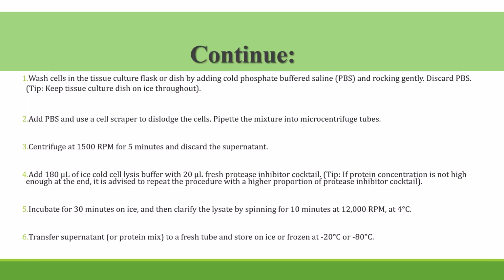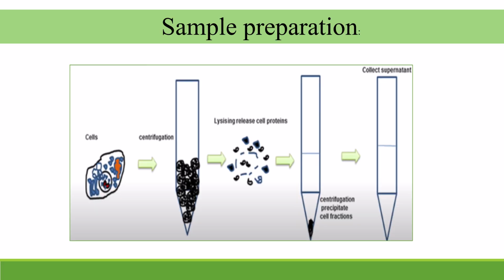Next step, the same, just read it once. Sample preparation. What have we done? We have cells. We have lysed them using lysis buffer. We went for centrifugation. After centrifugation, the lysis releases certain proteins.